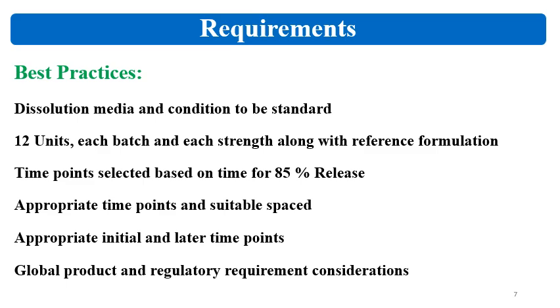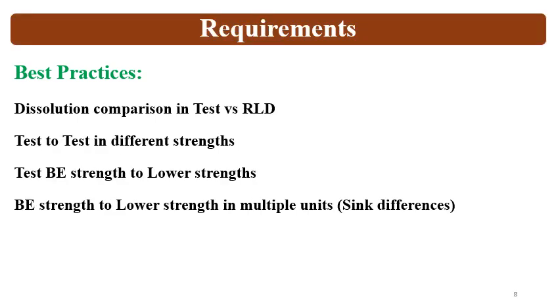Global product and regulatory requirement considerations: always consider whether your product meets the global requirements or not. If you follow standard dissolution conditions and standard dissolution practice, it is certain that the dissolution similarity will be proved and there will not be any query on the dissolution similarity key requirements.